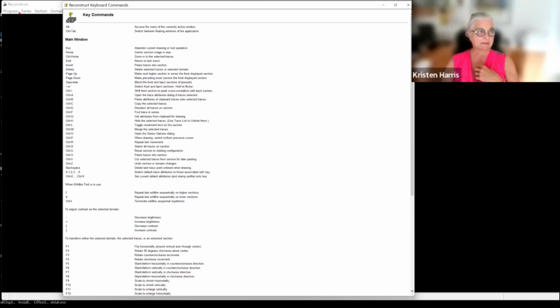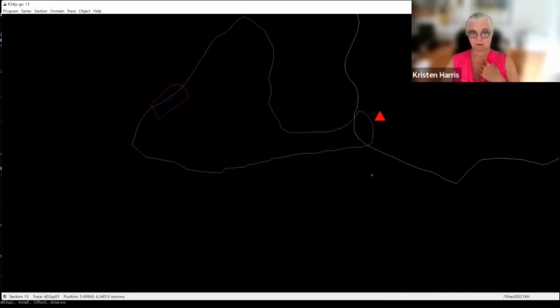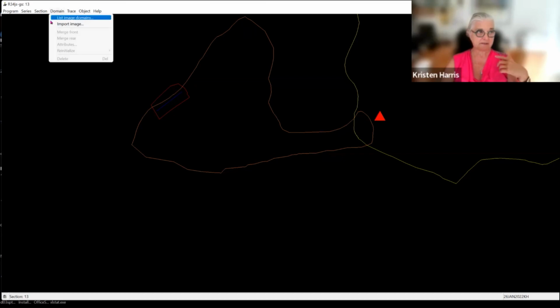So for example, if I were to go into a series and open a series, here's another thing that I think you might find interesting if you haven't done this before. You'll notice that right now, all that's coming up are the traces, right? It's because for this particular series, I've turned the domains off.